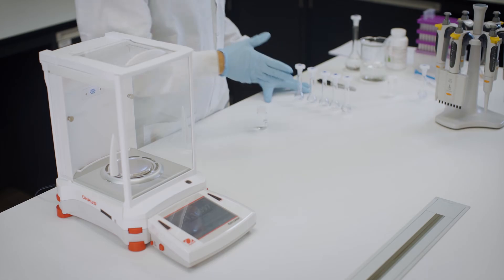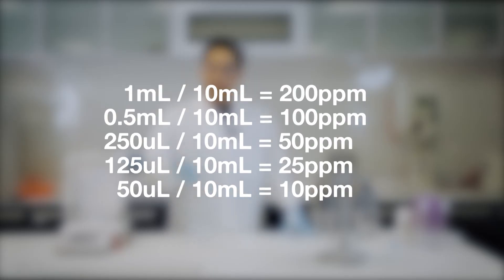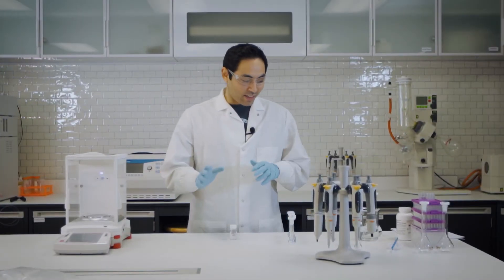From here, we're going to do our dilution. So we're going to do a 10 fold dilution for the 200 ppm. So basically what we're going to do is 1 ml of this into 10 ml for the 200, half a ml into 10 ml. So let's go ahead and get that done.